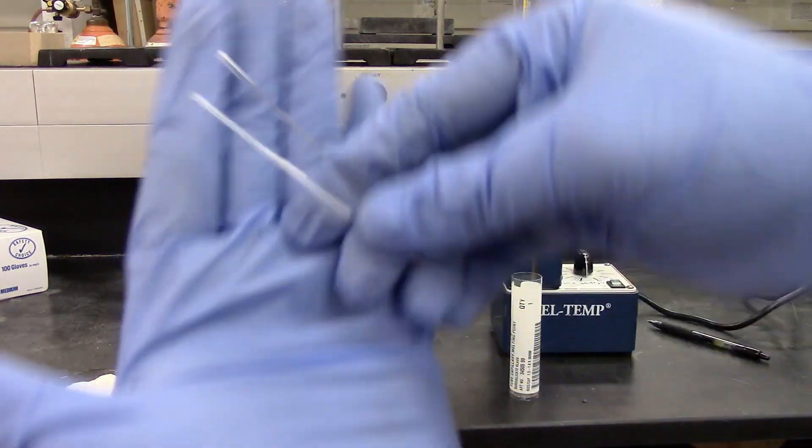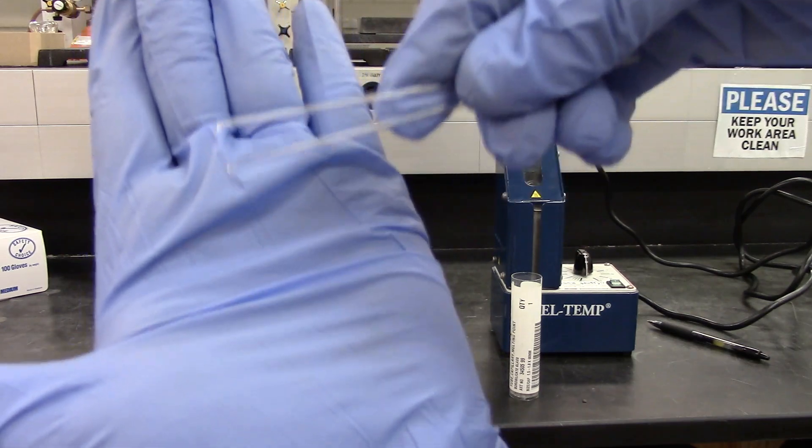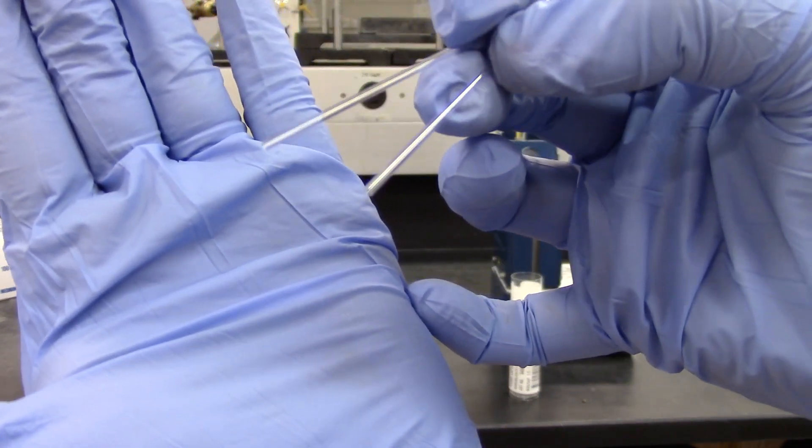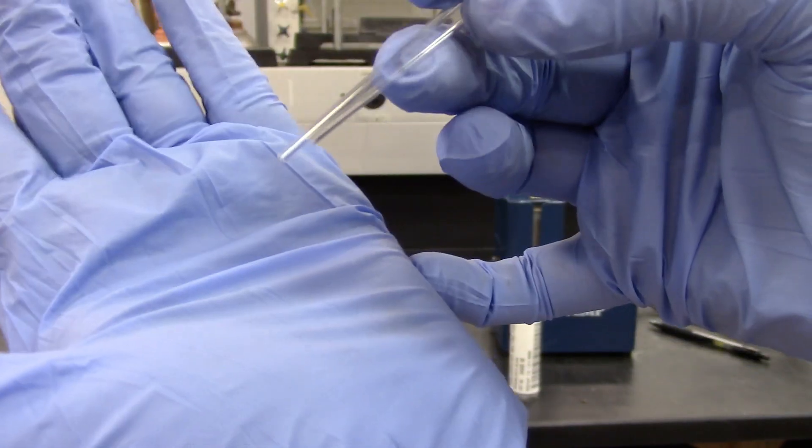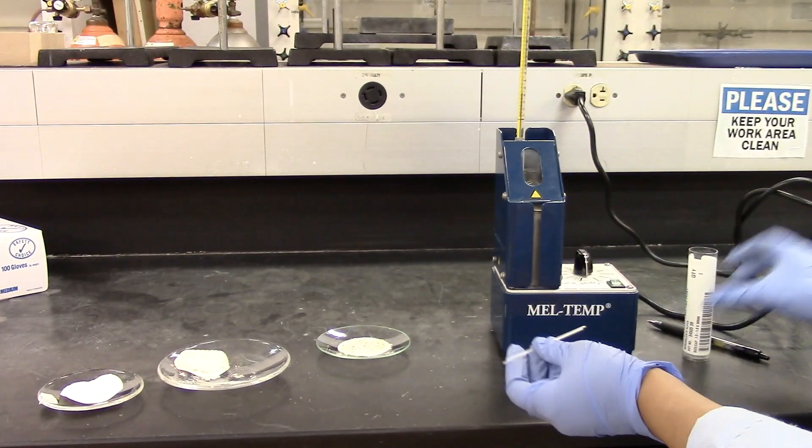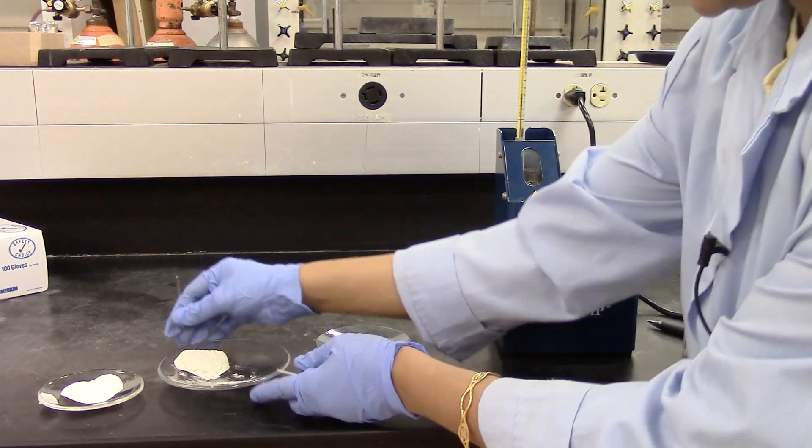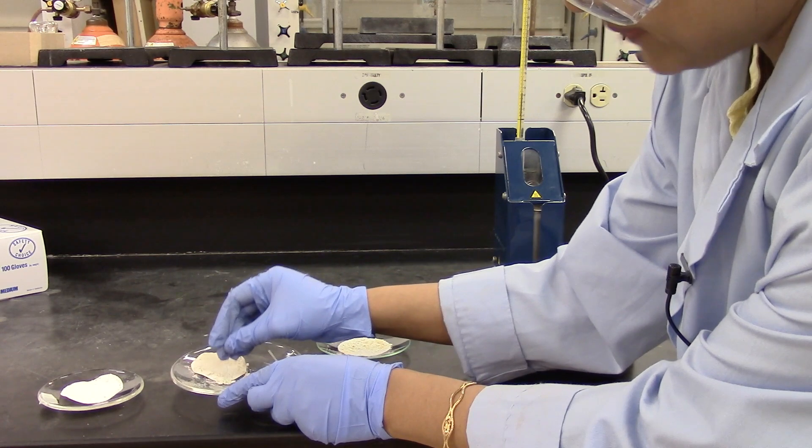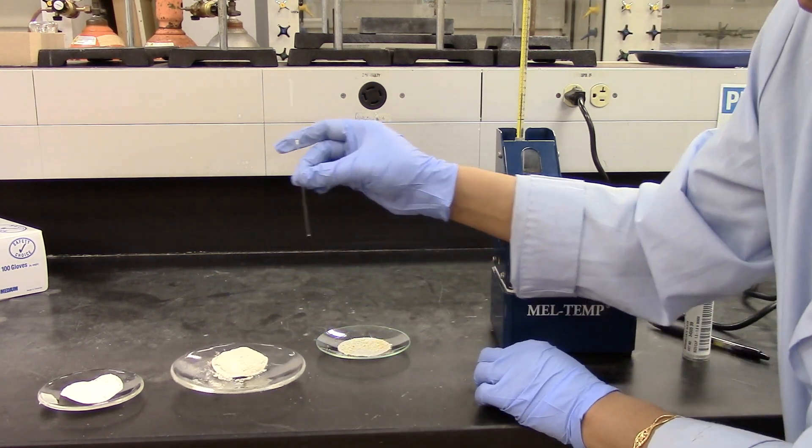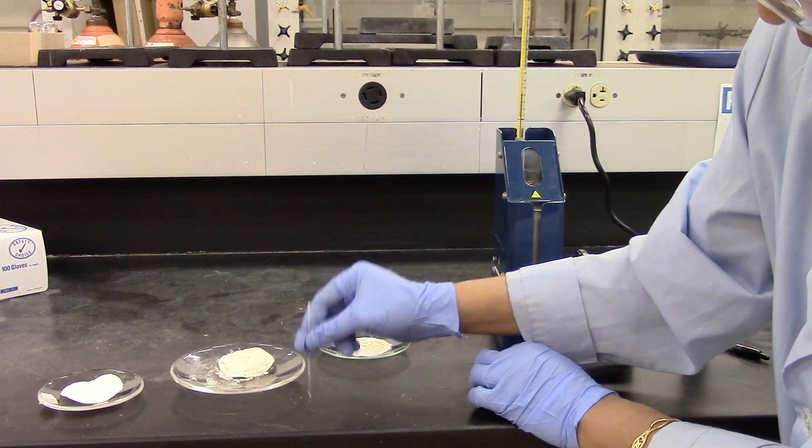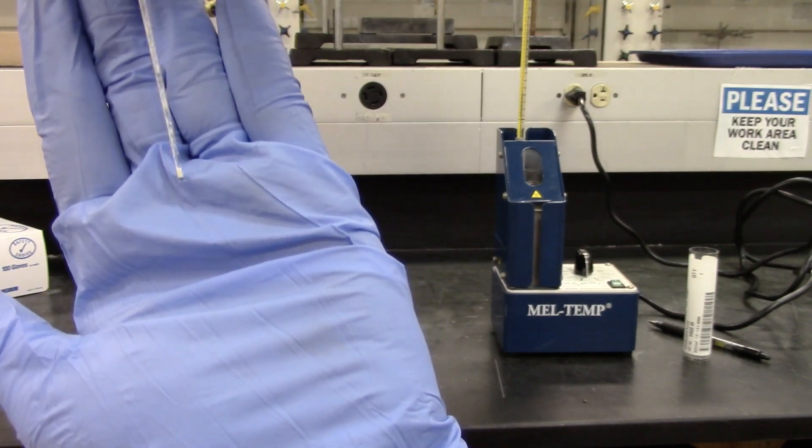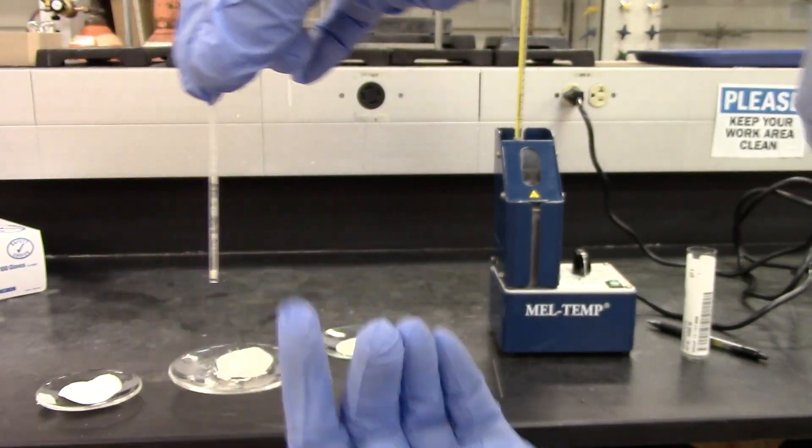If you can see, one end is closed. So that's the closed end. And this end is open. I'm going to tap some product onto this open end. So let's do the acetanilide. Tap some product and then turn it around and tap it down. So now you can see you will have a little bit of product into the capillary. And that's all you want.